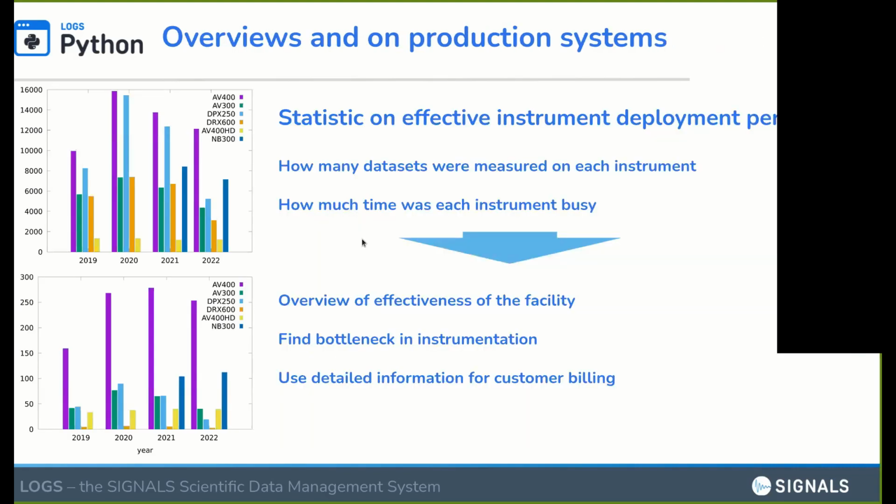Now I want to show you some more advanced examples that we implemented with this logs Python library that are more focused on the content. So I more or less leave the code now. One example we looked at was for a customer that wanted to see how the instruments are deployed in their system. They have used logs for a couple of years, and they have some instruments, and they wanted to see how these instruments were used over the years and how they are deployed.